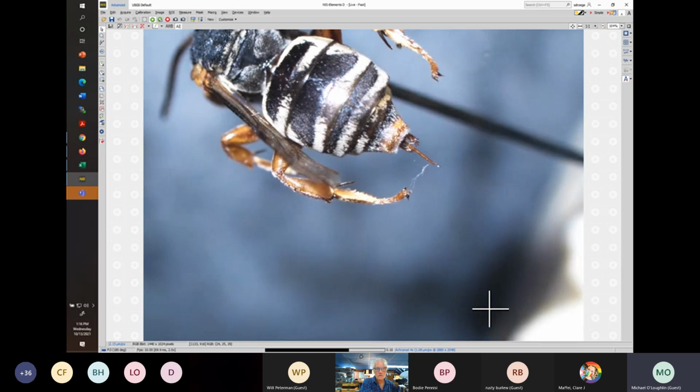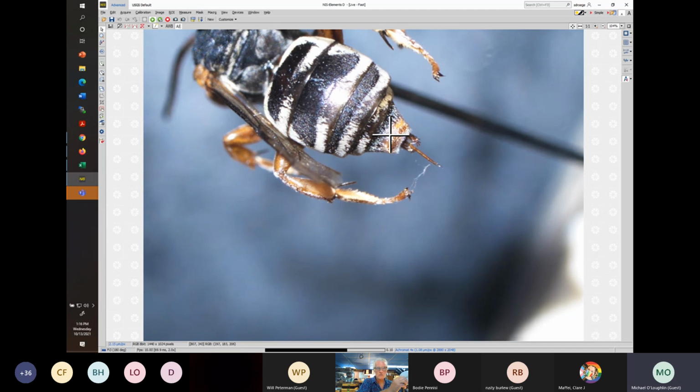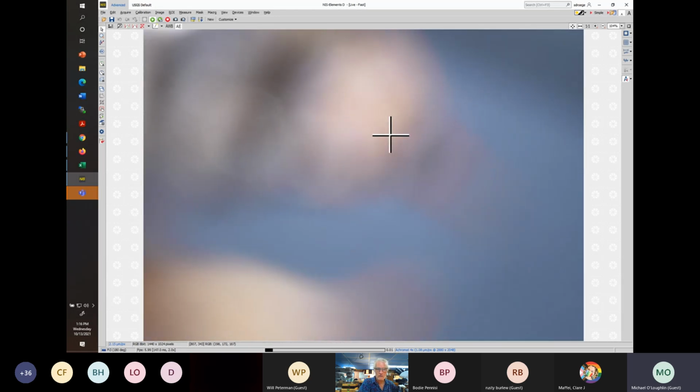the action is going to include the shape of these white bands of appressed hairs, whether this opening is large or small, and so forth. So this is the pseudopygidial area. It's not clearly seen here because of the reflectance, but we are going to zoom in and take a closer look. And at the end of this session, hopefully I'll show you several more of these.